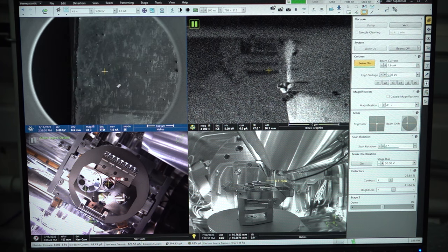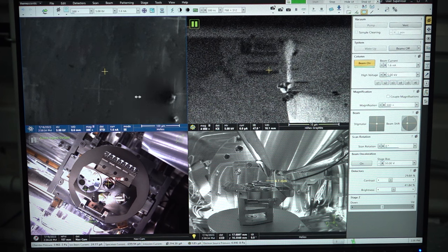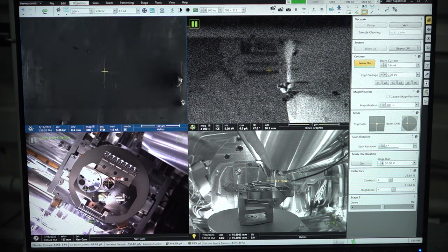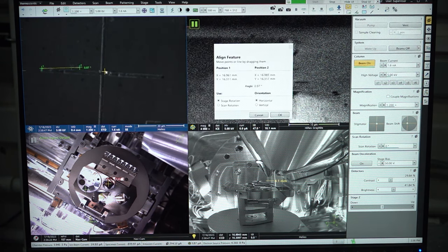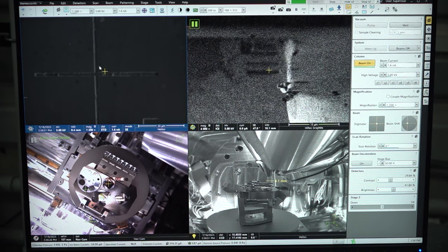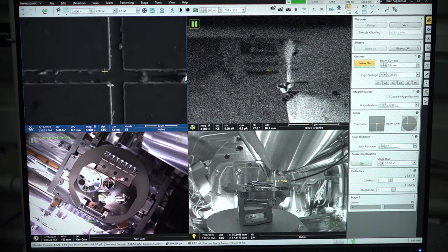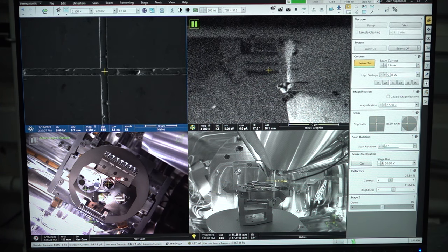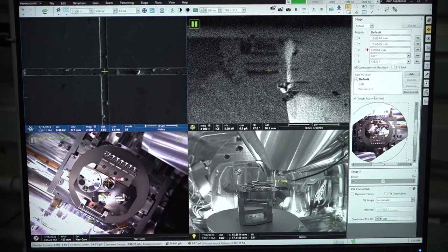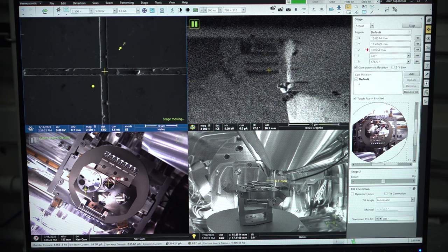I will choose a silicon sample here. These are the silicon crosses — I am just moving the sample to a specific location. Now I am trying to magnify the image. To align this, I go to the stage align feature and align this feature. Now I start focusing the image for better resolution. Whatever you see on this screen is the SEM image. If you would like to save the stage position, go to the navigation window, add the stage position, and just name it as an update. If you lose this position, you can restore it by double clicking.